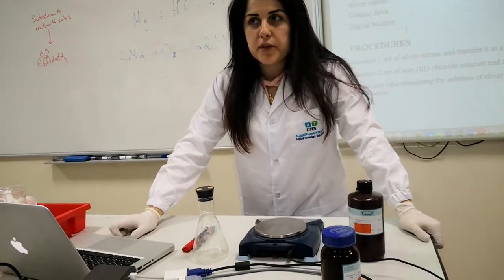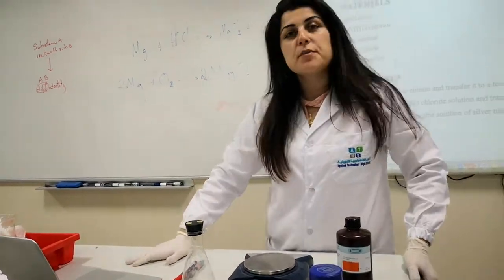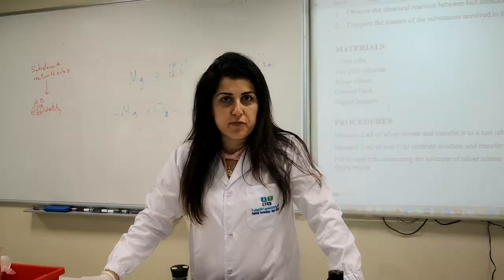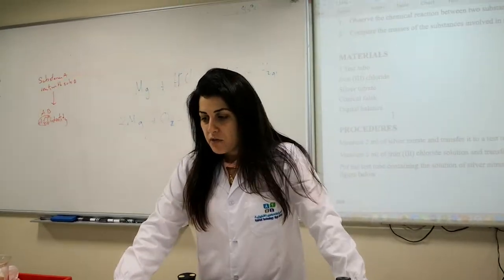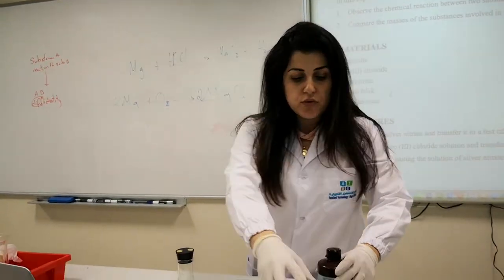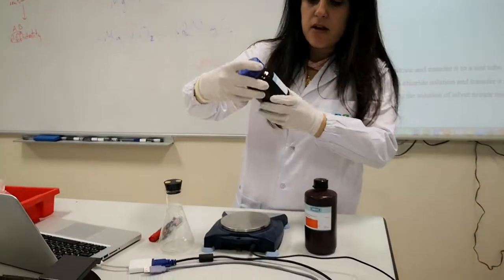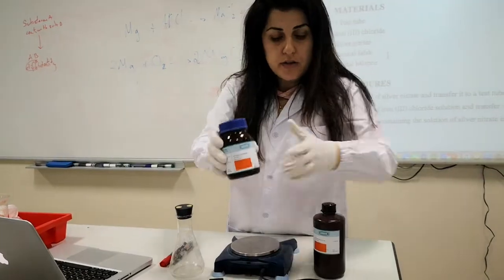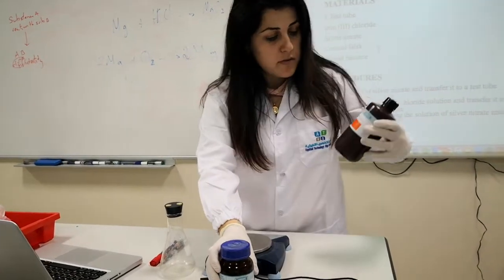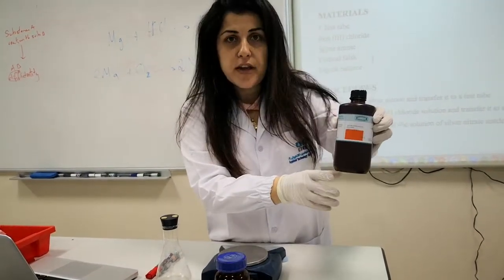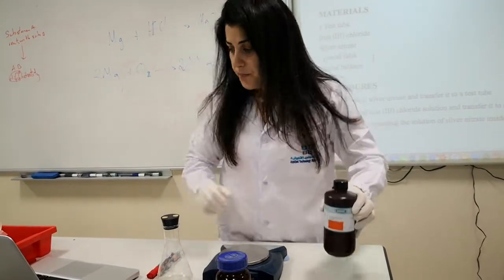In today's experiment, we are going to demonstrate the law of conservation of mass. For this, we are going to react iron(III) chloride with silver nitrate solution.